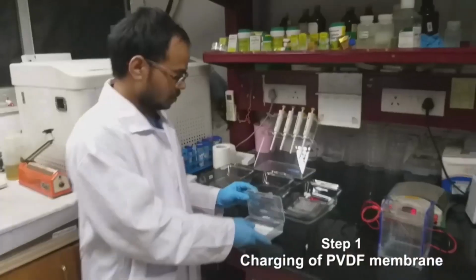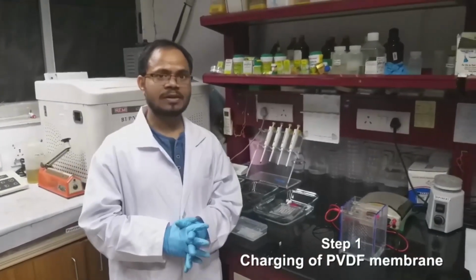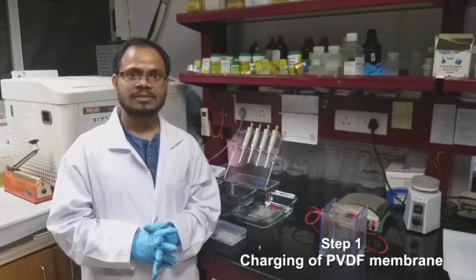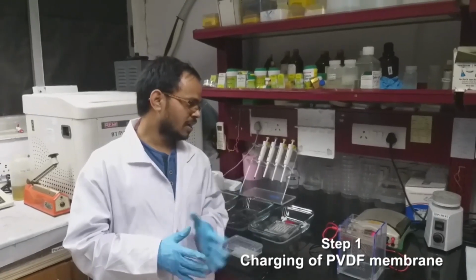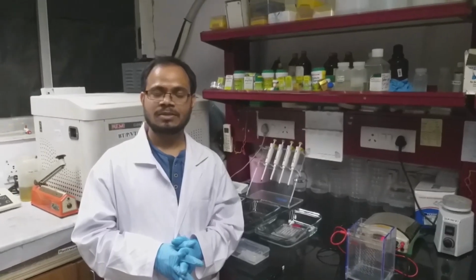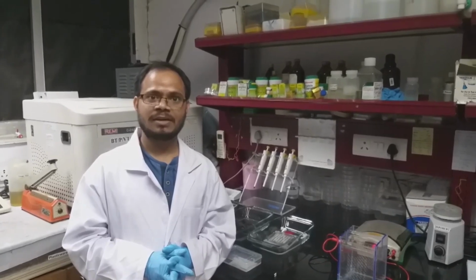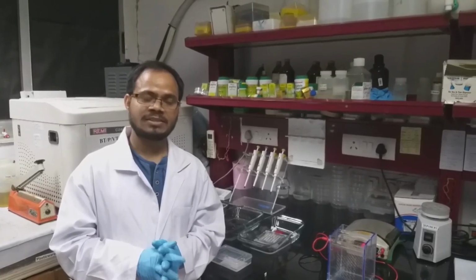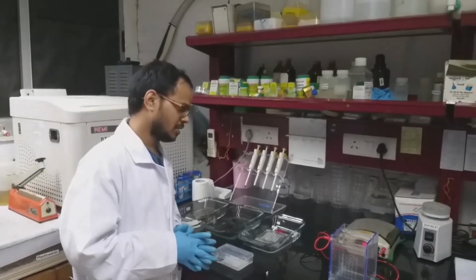transfer buffer. While doing the transfer, we need to consider a few things. The buffer should always be in chilled condition, otherwise during the transfer at high voltage it will generate high temperatures, so that may degrade your protein or decrease the efficiency of the transfer. That's why we need to keep the buffer always in chilled condition. And let's start the procedure.